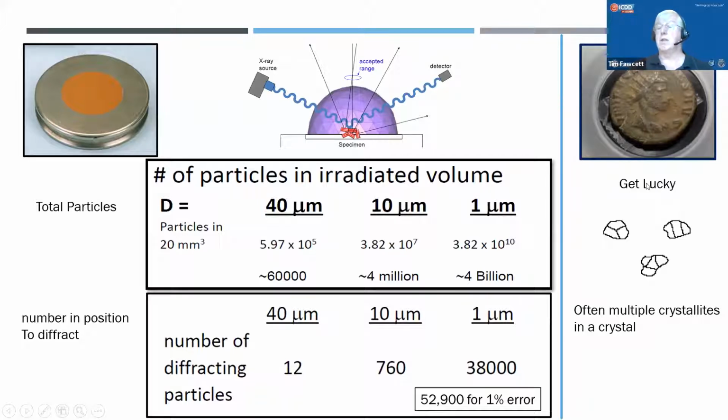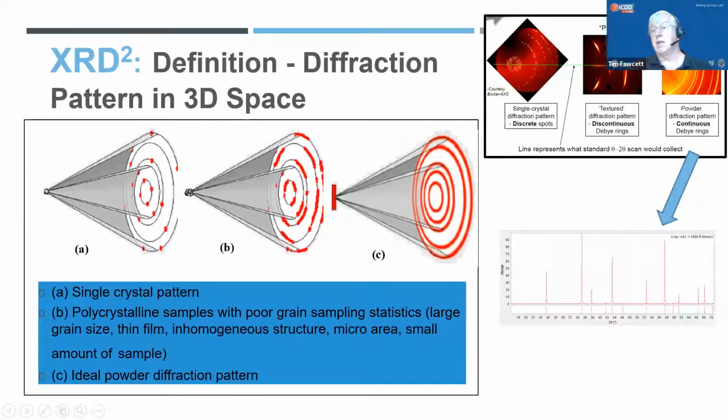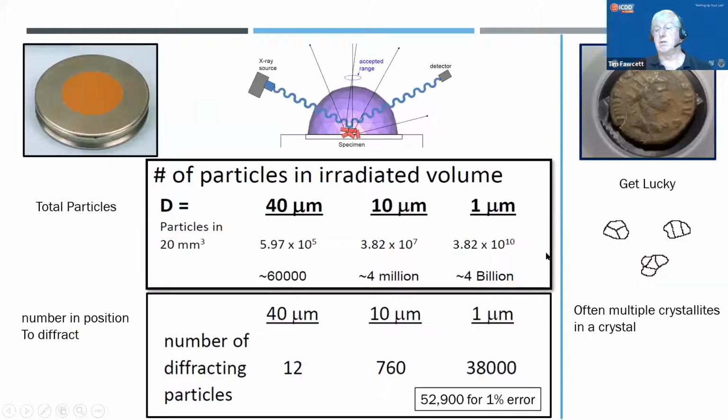Most of the time, if you're looking, for instance, at coins, they're used from rolled metal stock and they're punched, and you would have more of a situation where you'd have oriented phases and not perfectly random phases. But sometimes, like I said, we get lucky.